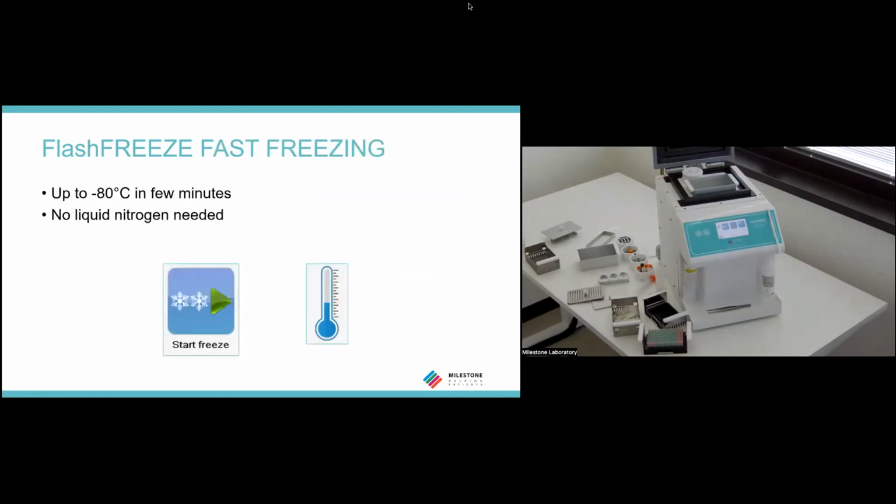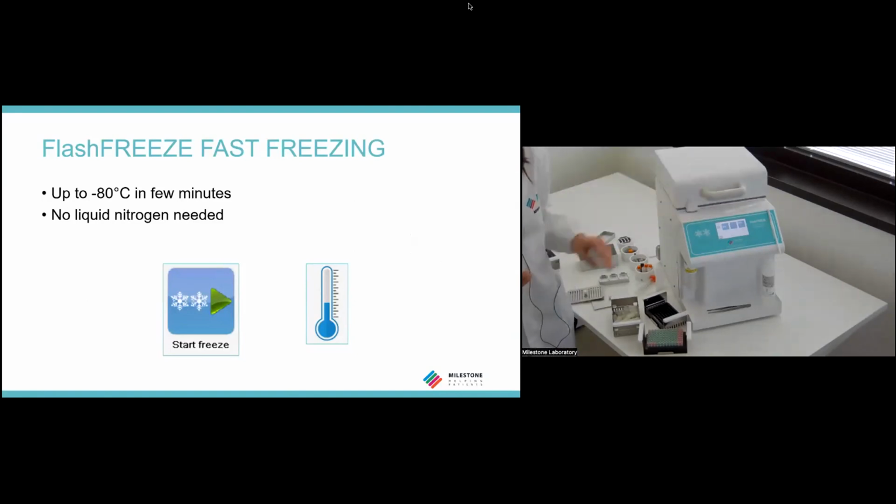When a fast freezing is necessary, the reagent temperature is brought to -80 degrees and the sample directly immersed in it. This freezing requires a few minutes or a few seconds, because it depends on the sample type and volume. When frozen, the specimen can be transferred to the biobank and the device is available for the freezing of other samples.